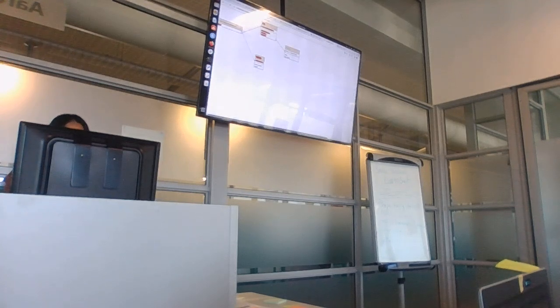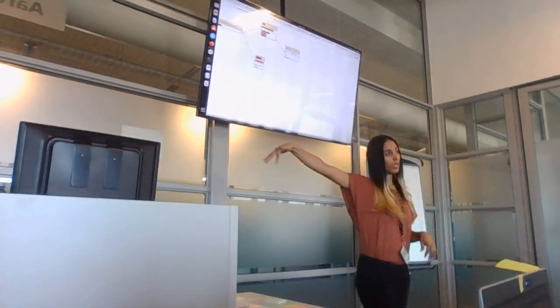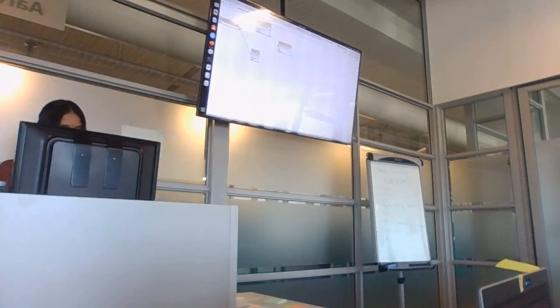If you have now made a paper like that guy from Canada that made a machine learning one, he actually exported his pipeline like this as an image, SVG, which is nice. And then, yeah, you can use it for publication purposes.